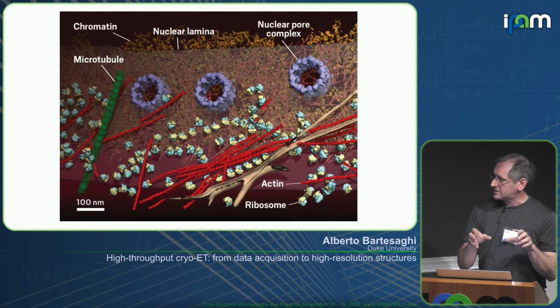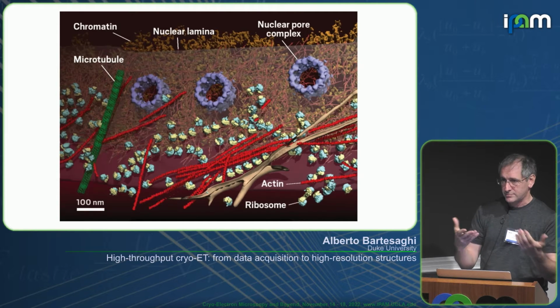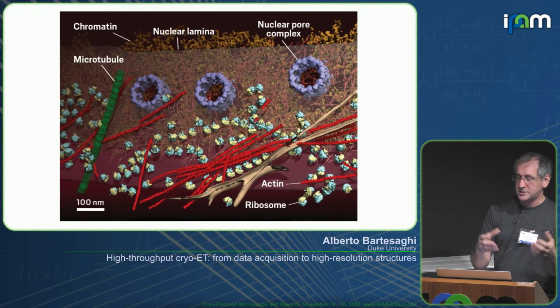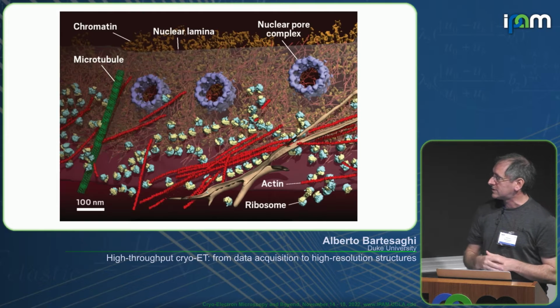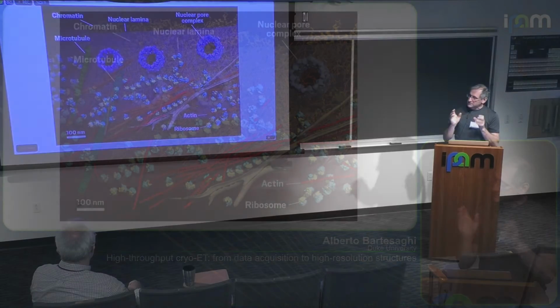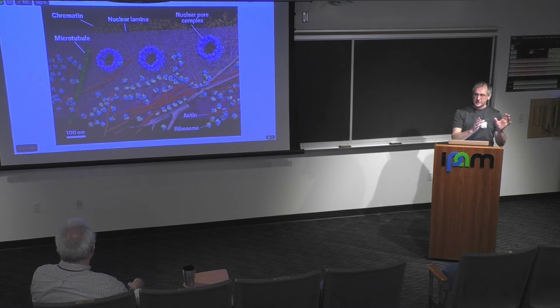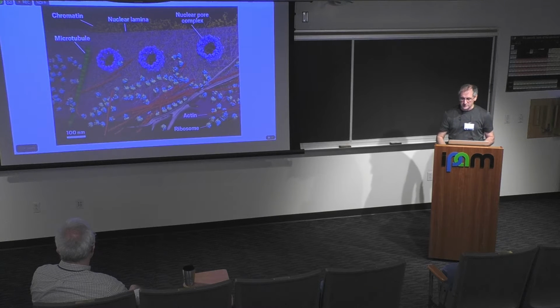And then you also have proteins that are actually present multiple times, and that's being cryo-EMers, we can go ahead and take advantage of that repetition and average them in 3D, and that's what we call sub-tomogram averaging. The reason I'm saying this is that there are really two objectives for doing cryo-electron tomography. One is to get the overall structure, to see where the components are situated with respect to each other, and the other is to get high resolution representations of the things that repeat themselves using averaging.